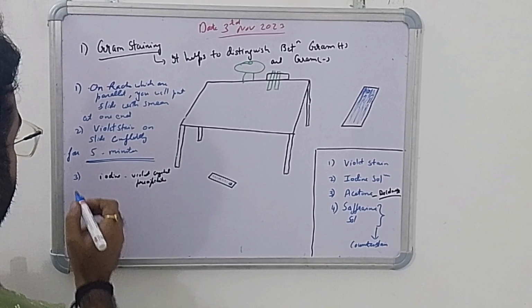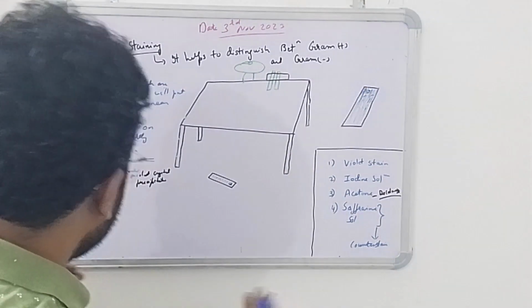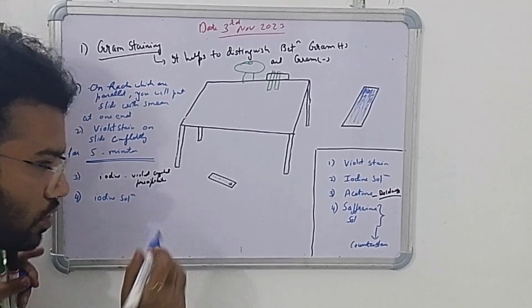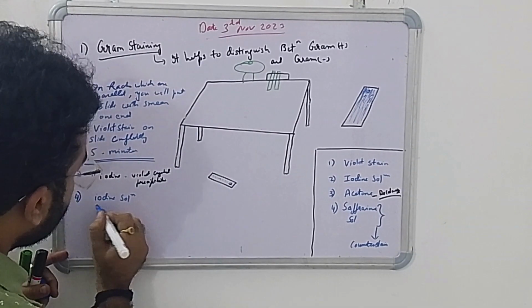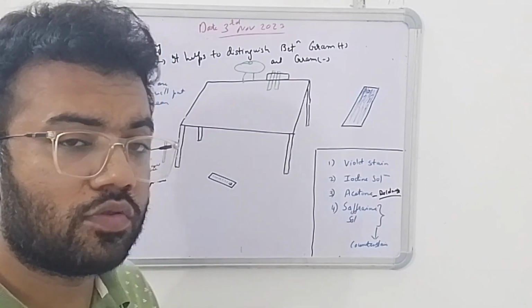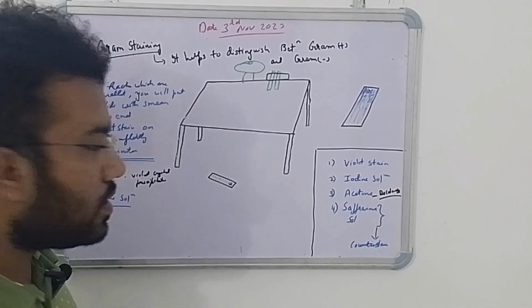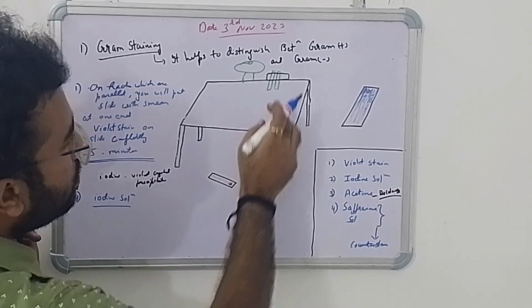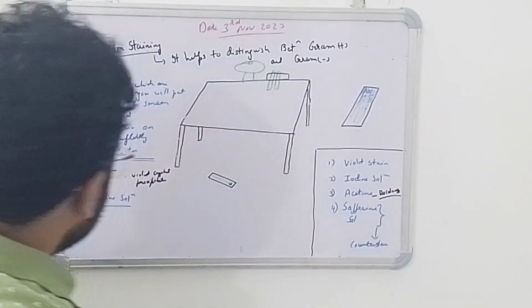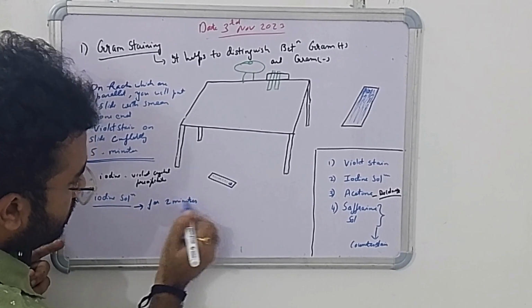Now the fourth step: put the slide back on the rack. Now add iodine solution again, which should be fresh, not the used one. Put this fresh iodine solution on the slide, which is placed horizontally on the rack near the sink.